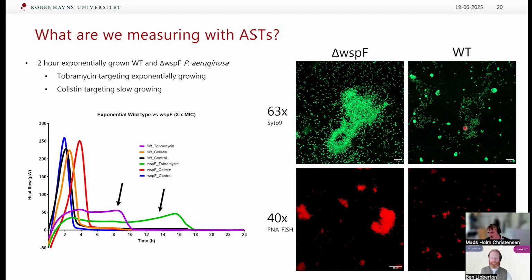I'm not sure if I would call it biofilms. It's just closely located single cells. Yeah, so it's just kind of a point to think about, a point for discussion. Like when we take a sample from a patient, we remove the bacteria from where they are, we disrupt biofilms and aggregates, and then we plate them out or culture them in liquid media. Like what are we actually measuring?